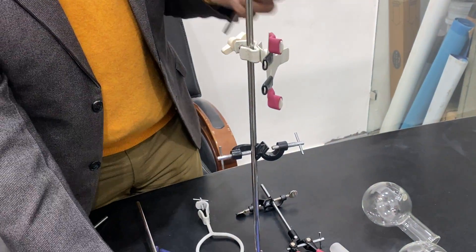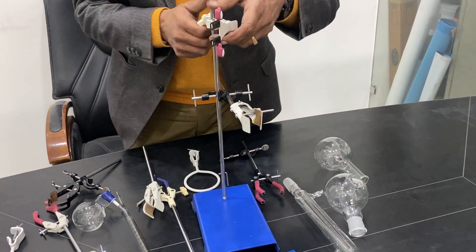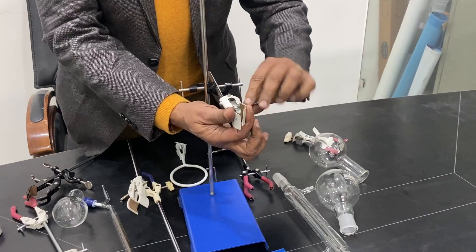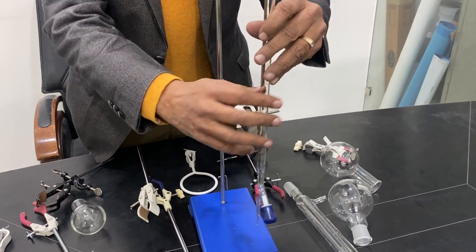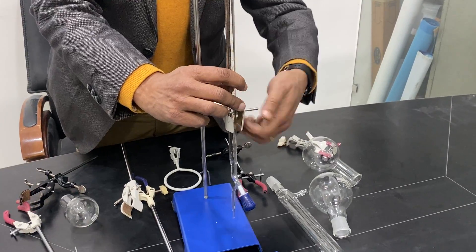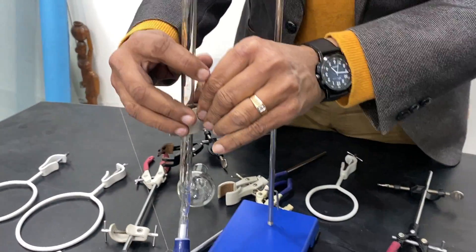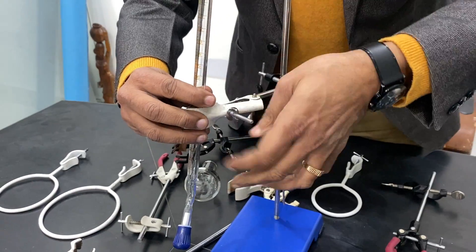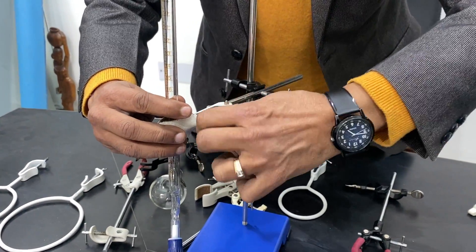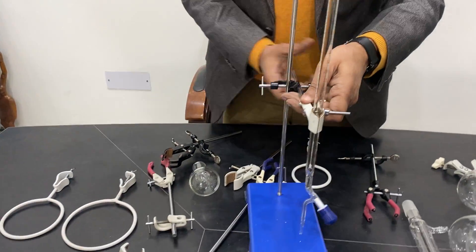Let me show you the other way. First, I have to fix the clamp, take it out, and then make it tight. Then hold a burette inside. From the side, I will show you a side view of how this works. You can see from the other side — just tighten this and hold it.